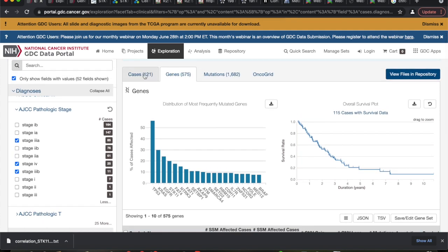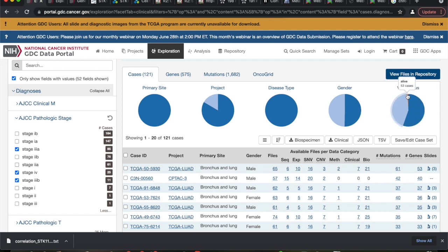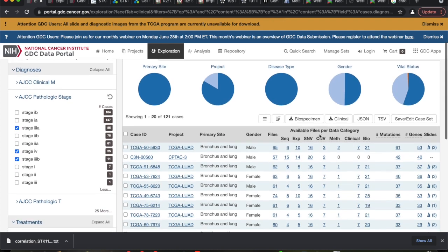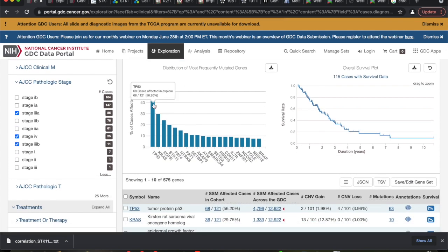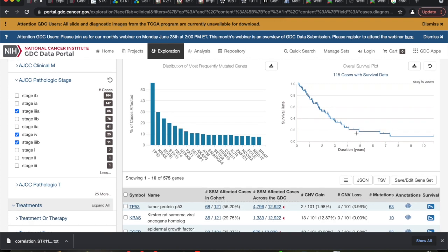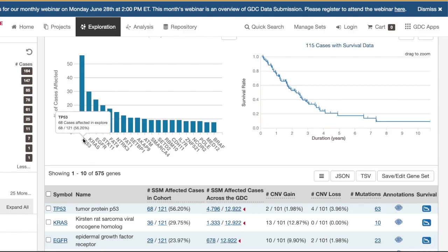Going to the Genes tab, we can see in 53 of these cases the individual was alive at sampling, and 67 of them died. Looking at the survival rate — oh my gosh, that's horrible. After five years, about 80% of the people at this stage die. I know P53 will be hard to find its gang because it doesn't really change in expression, so I'll ignore that. KRAS and EGFR people study extensively.